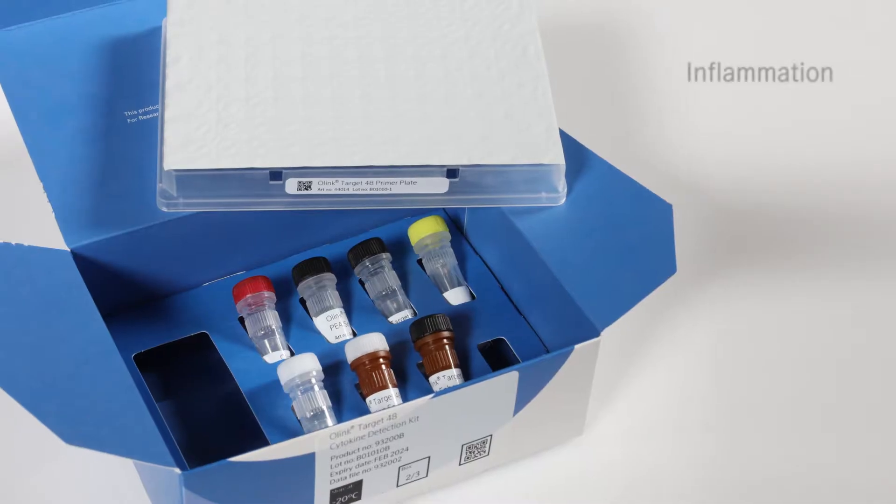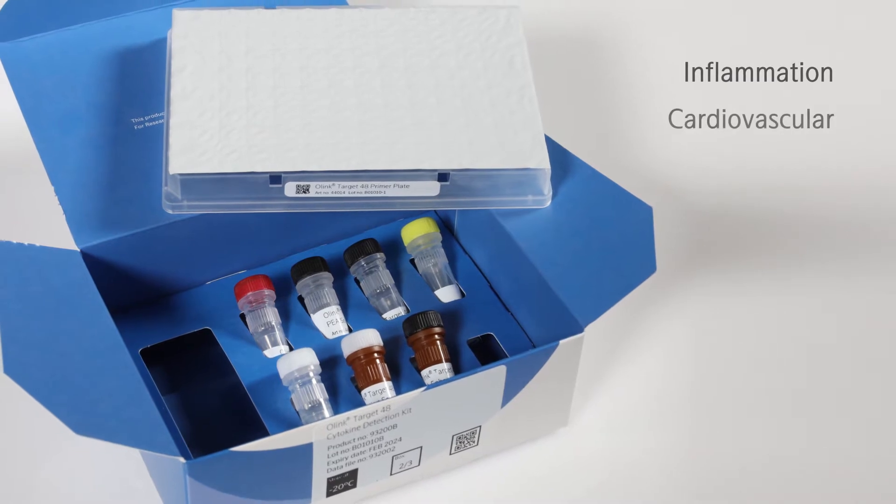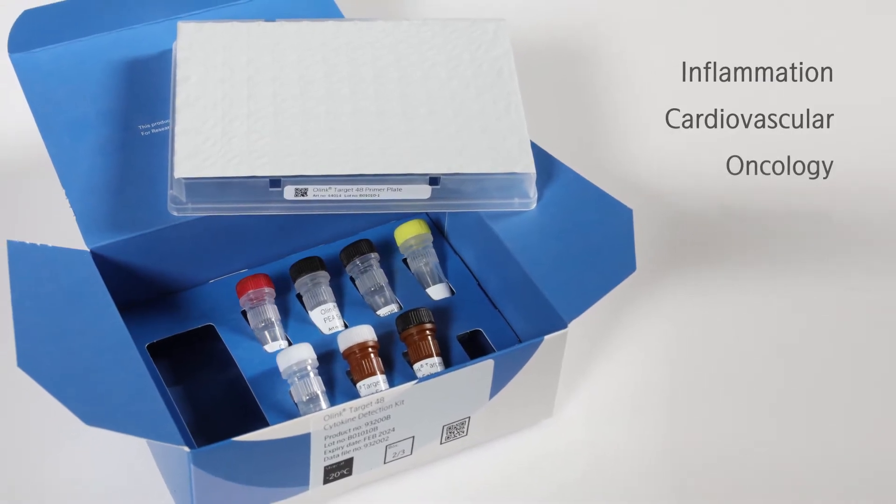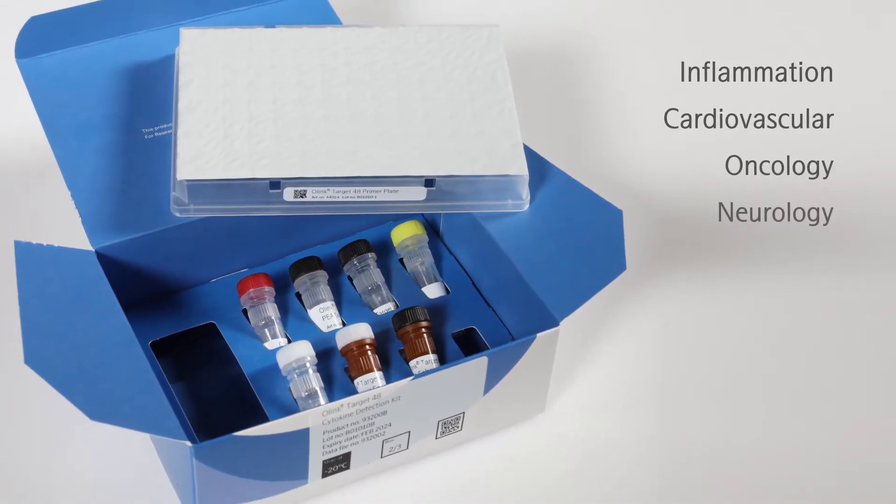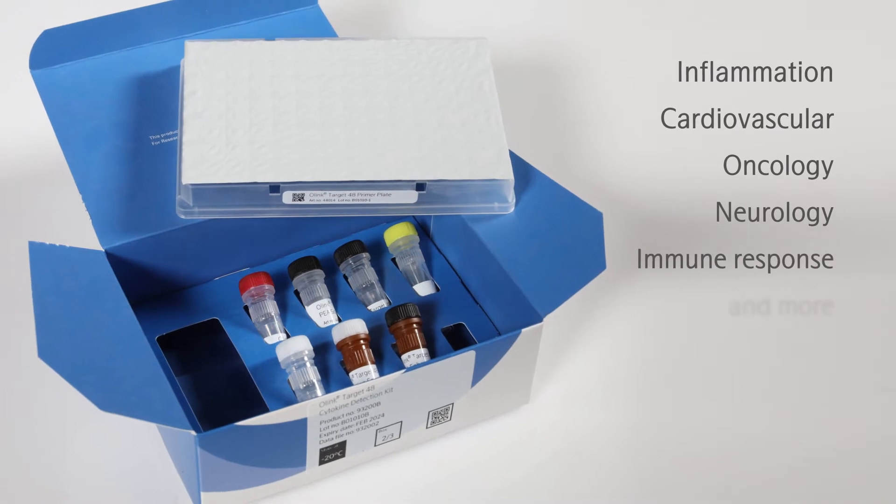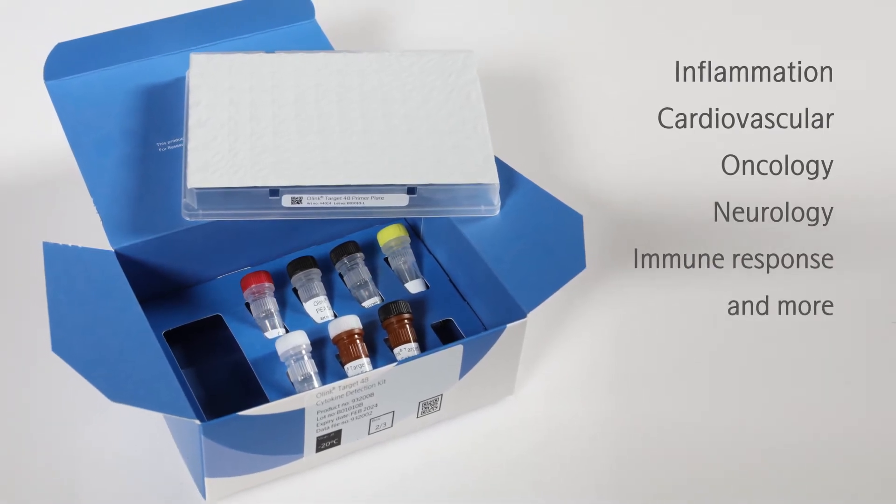Each O-Link target protein panel is designed to study a specific disease or biological process, such as immune response, using only a microliter of blood.